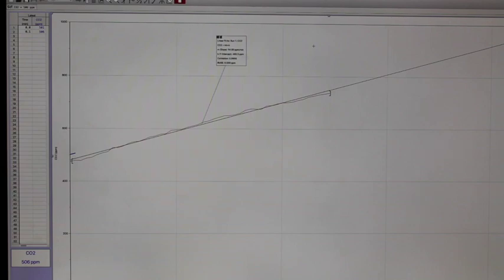And there we go. So we started just about at the same level of CO2, which is good. You can see that so far that line is starting, and the line has a lower slope than the other line. If it continues that way, we'll see. We're going to run this over the course of 5 minutes.